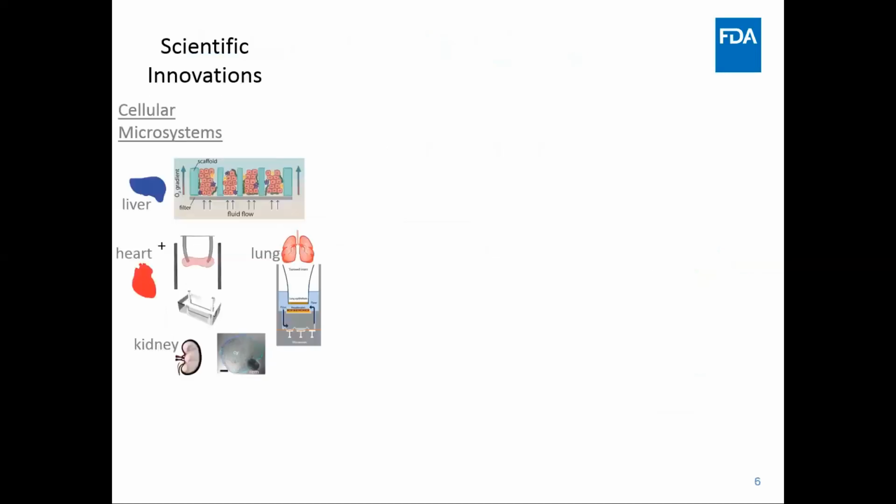The scientific innovation that we evaluate in our lab are cellular microsystems. We're starting now to give an emphasis to the integration of induced pluripotent stem cells in these microsystems. These induced pluripotent stem cells can be differentiated into any cell type in the body.